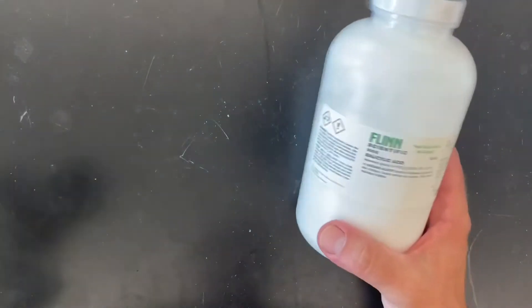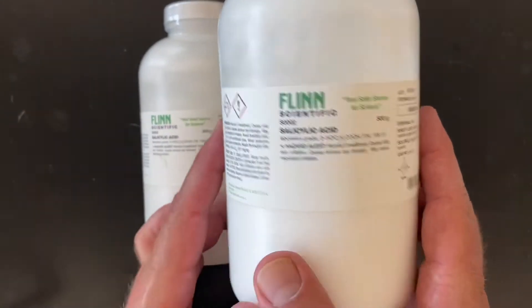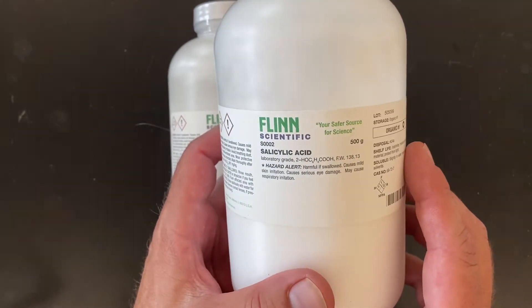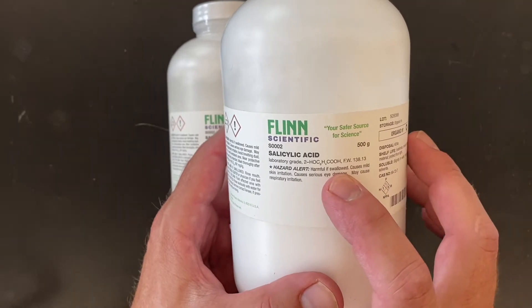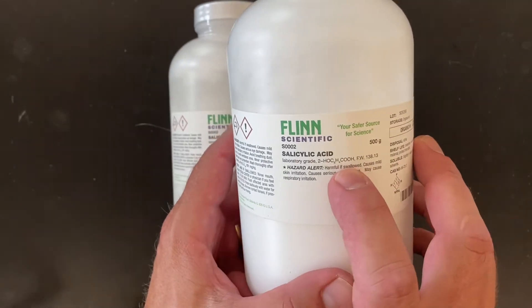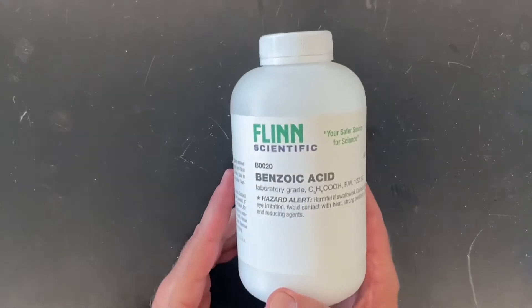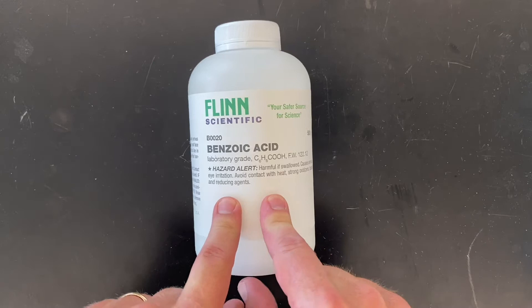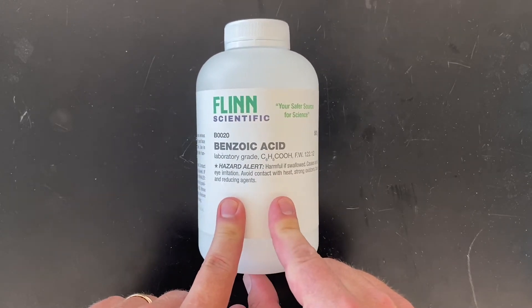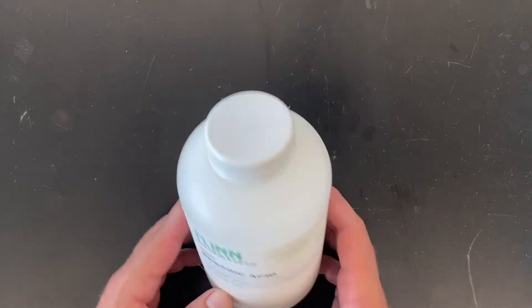Some more solid acids — these two happen to be salicylic acid. You may have heard of that; they put it in cosmetics to help with acne and other things. You could also use it to make aspirin, which is acetyl salicylic acid. We were running low so we got two more 500 gram bottles. We also got some benzoic acid — we're going to make some esters with it. You can make some pretty nice smelling compounds with benzoic acid.